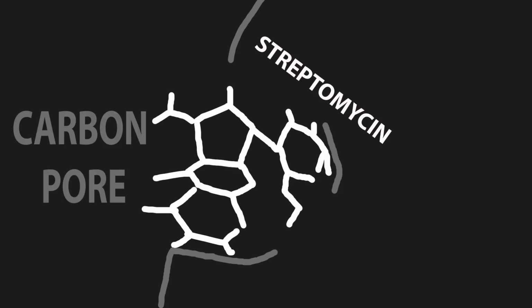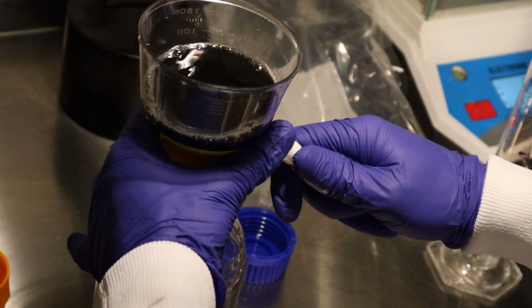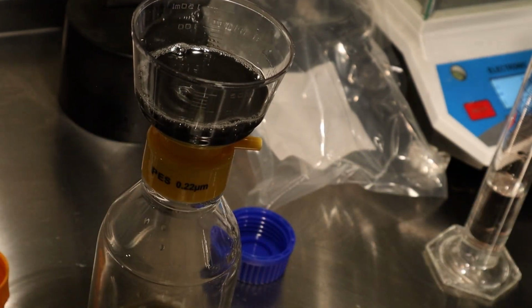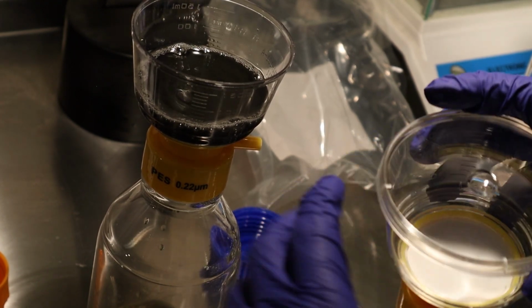This would allow the streptomycin to absorb into the pores of the activated charcoal. 30 minutes later, the next step was to filter off the liquid. But it got clogged immediately. Not wanting to spend weeks vacuum filtrating, it was clear it was over. My first attempt at the streptomycin extraction was a complete failure, but I learned a lot from doing it. I decided to dump the culture and start over.